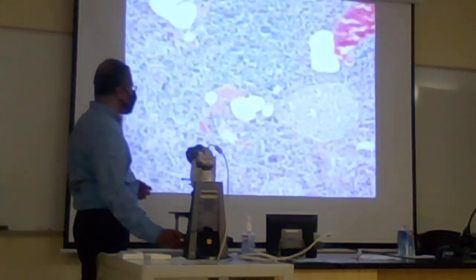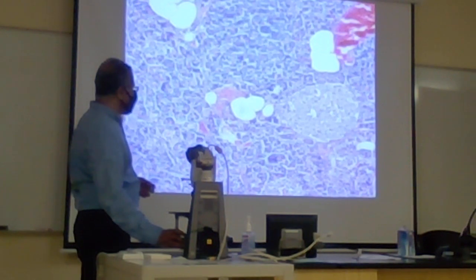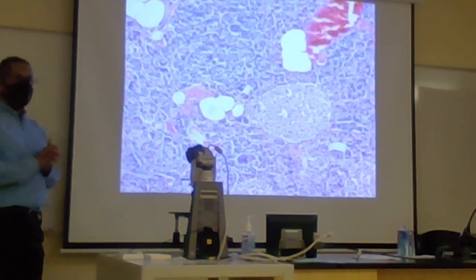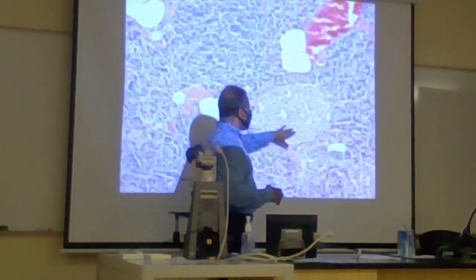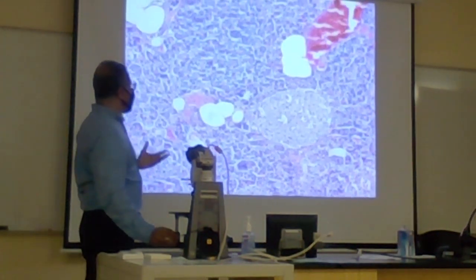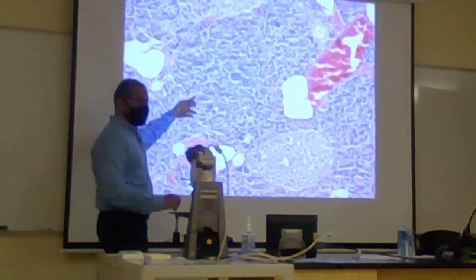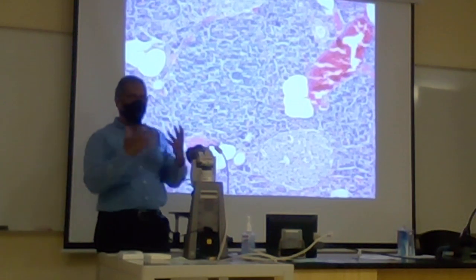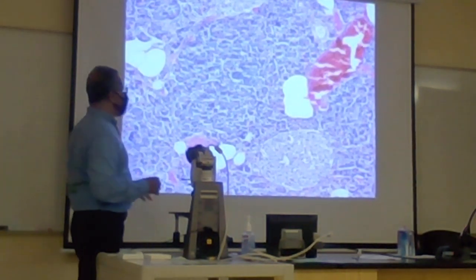So let's zoom into this. You won't be able to identify the cells as alpha or beta, but you can clearly see the islets of Langerhans. This is probably how you see most pancreatic slides: 1 or 2 islets. These are all basically acinar cells. The little white spaces are the ducts of those acini, and the larger spaces are the larger ducts.